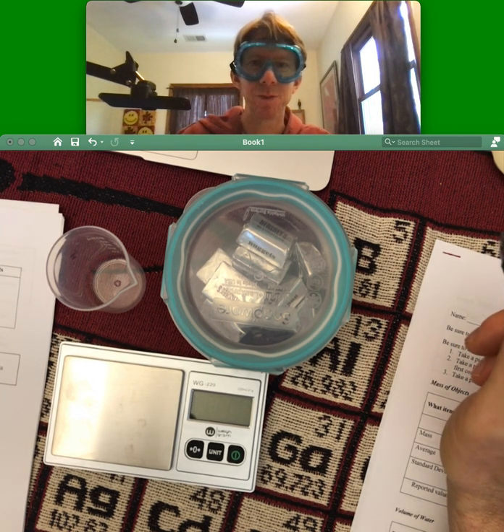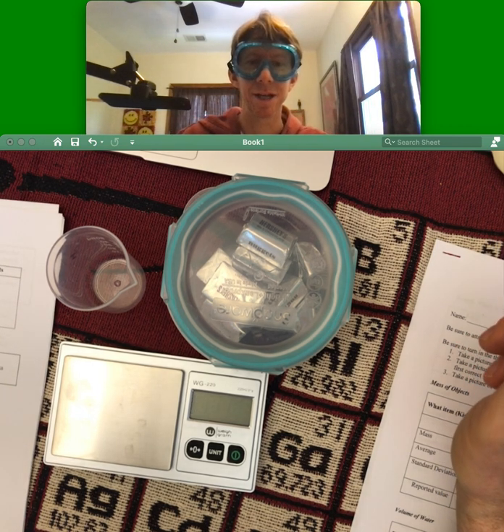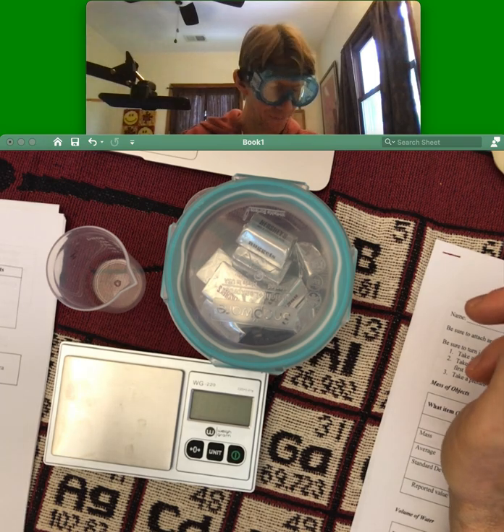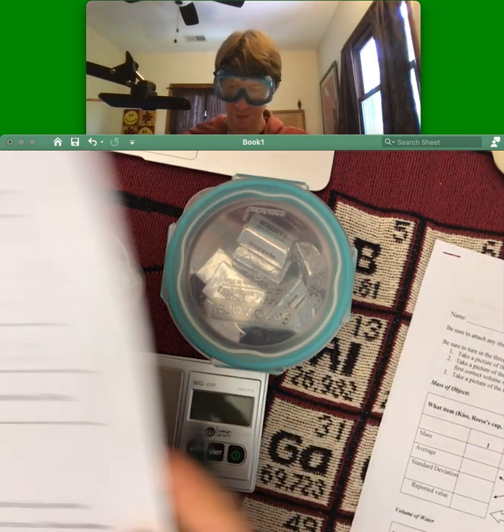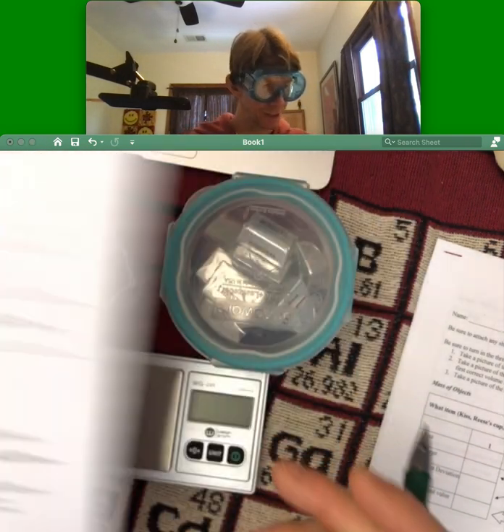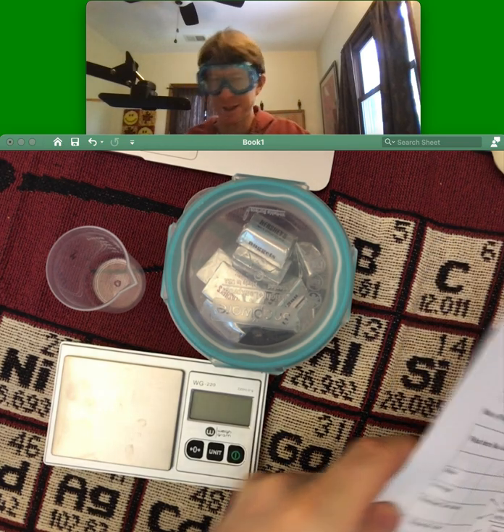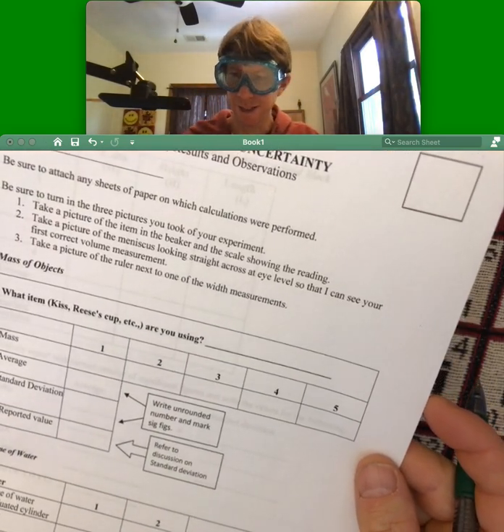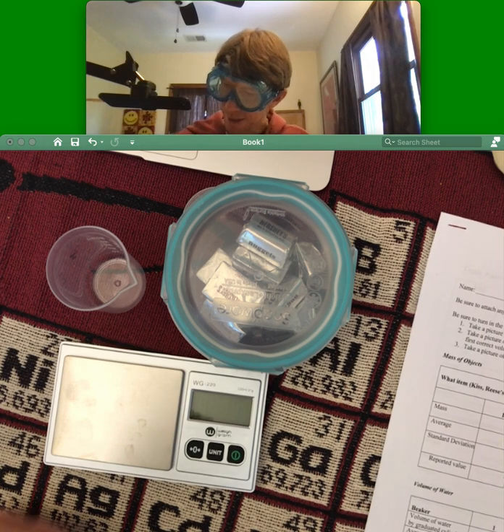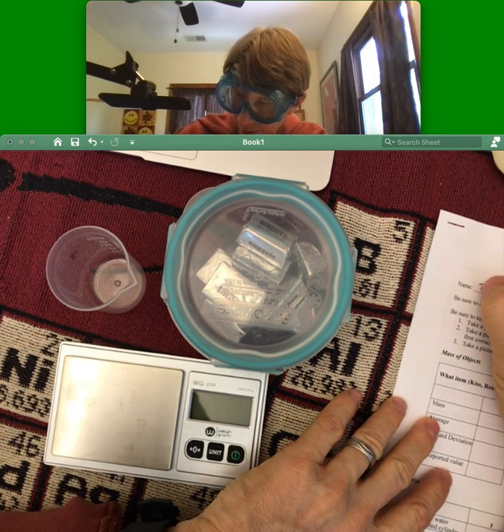All right, for measurement and uncertainty, let's go ahead and get to the actual lab. So I've got my lab procedure. I'm on page number four here, and I've got my handouts so I can write down my data.